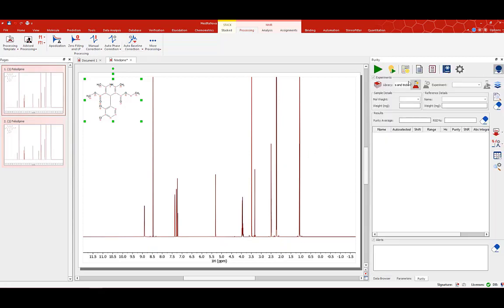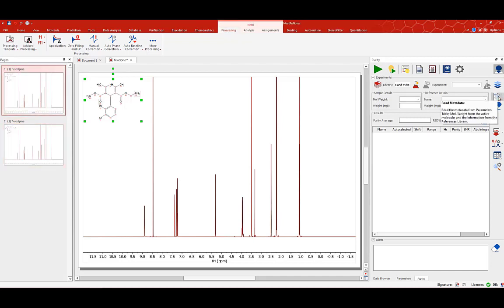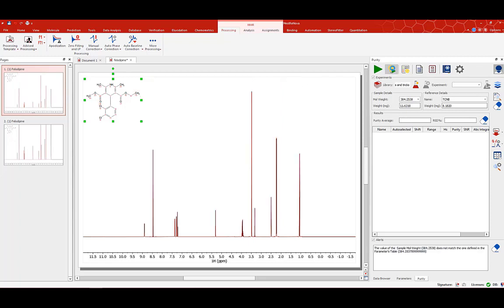Then I can go to my QNMR plugin — Purity — and here I can read all the metadata for my first experiment. I can read it again just by clicking one button and it reads everything that I have put in my experiment. Then again one more button and you will see that QNMR is done automatically.